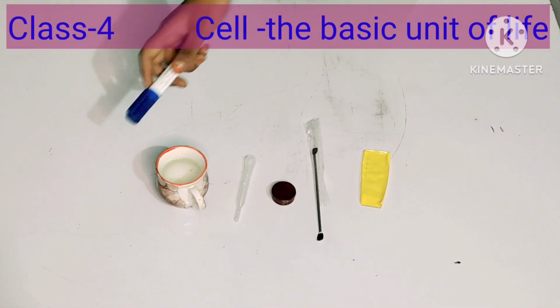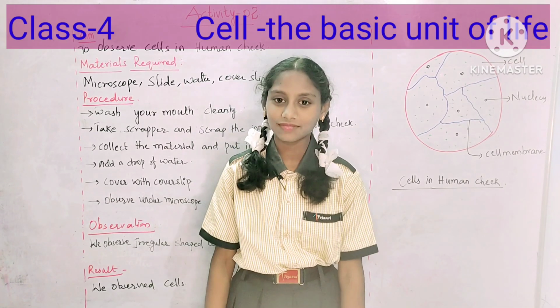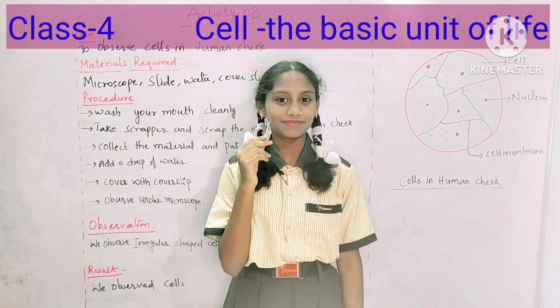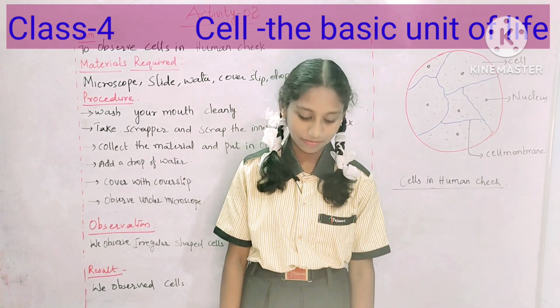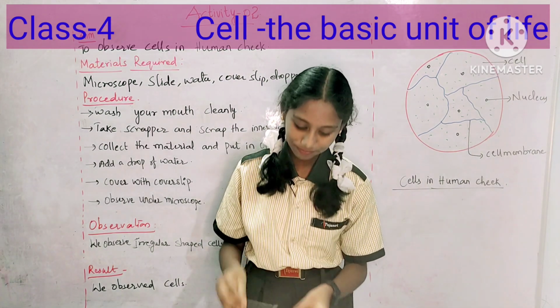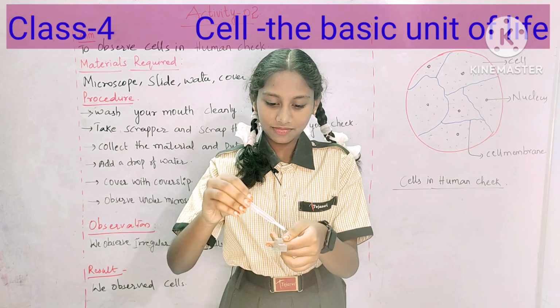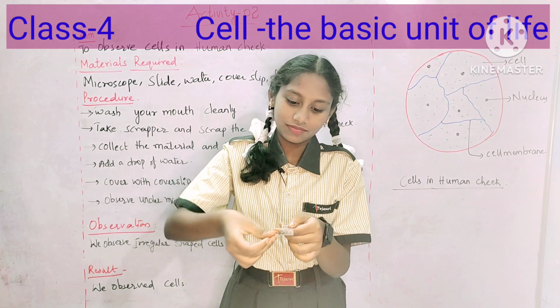Let's see the materials: water, dropper, cover slip, scraper, slide. Friends, take a scraper. Now scrape the inner side of your mouth. Now take a clean slide and put the material on it. Now add a drop of water. Very good. Cover it with a cover slip. Press gently.